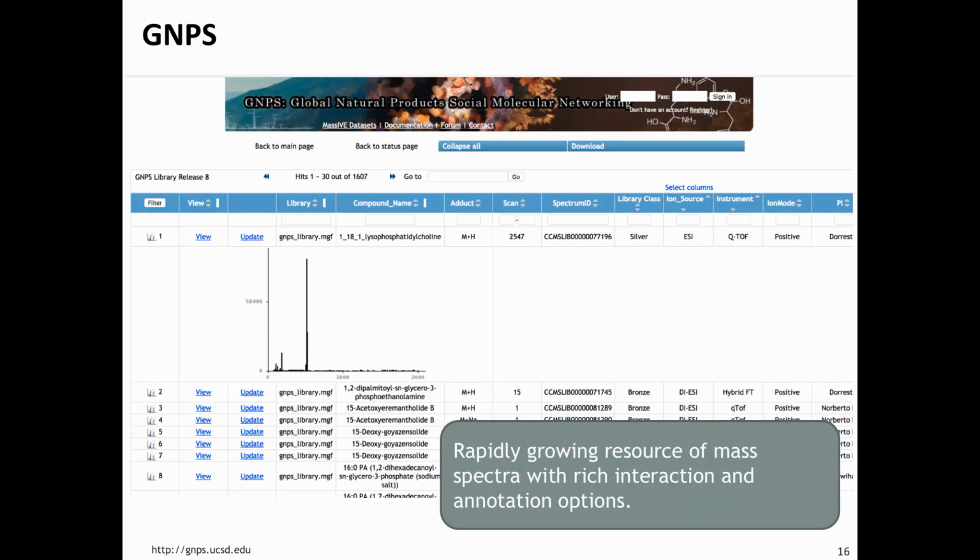Then, more recently, the colleagues at UCSD started implementing a database that is called GNPS, Global Natural Product Social. And that is a place where you can upload your spectra. So the idea is you just don't keep your spectra, you upload everything that you care about, and perhaps also the rest. They actually appreciate when you upload all your spectra.